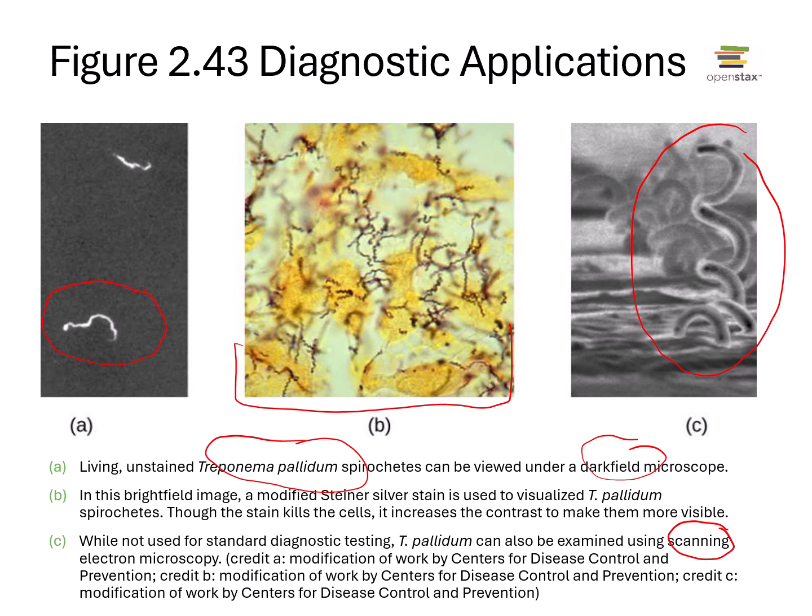Although EMs, electron microscopes, are not really used for diagnostics, they can help you further identify or characterize your bacterium. And remember, we can also use fluorescence microscopy, using labeled antibodies that are very specific to identify whether or not a specific bacterium like Treponema is present.